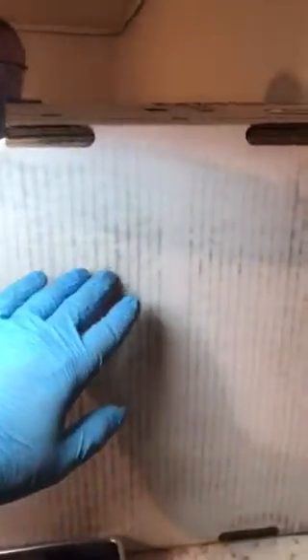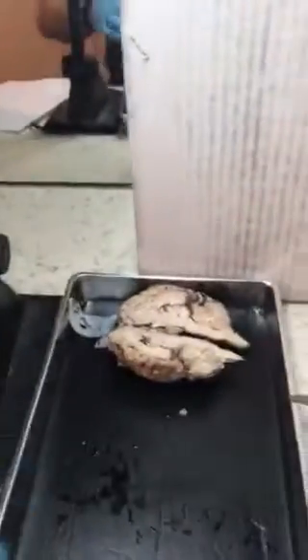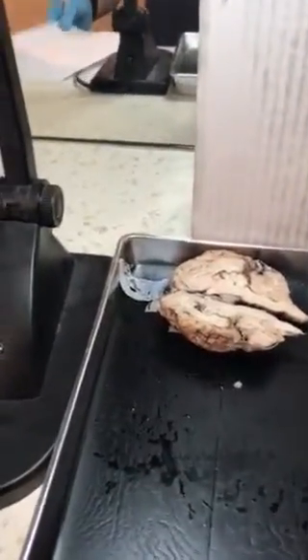So this is my workstation here. This is my cell phone, which is not working, so I'm using my wife's cell phone to record this. But this is my workstation. I have my dissection tools, the sheep brain. I have a box here that I'm going to use to mount the cell phone on top so I can get an angle when I'm doing my dissection.